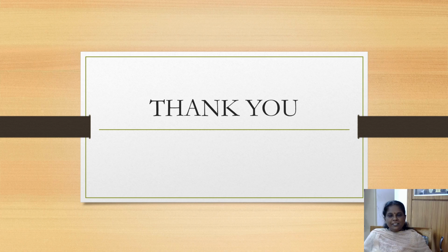Dear students, in this presentation, we have seen what an electrochemical workstation is, what the components of an electrochemical workstation are, and how it can operate in different modes such as amperometry, chronopotentiometry, and electrochemical impedance spectroscopy, etc. We have also seen what data can be obtained using the electrochemical workstation and how we can interpret the voltammogram and cyclic voltammogram.